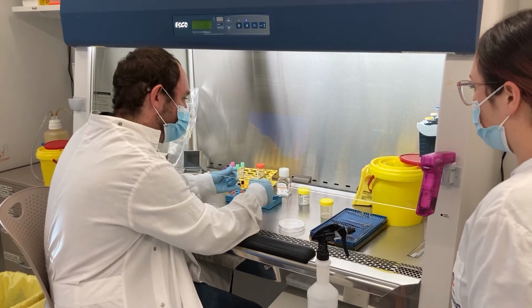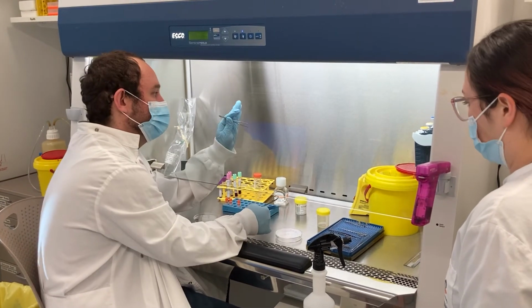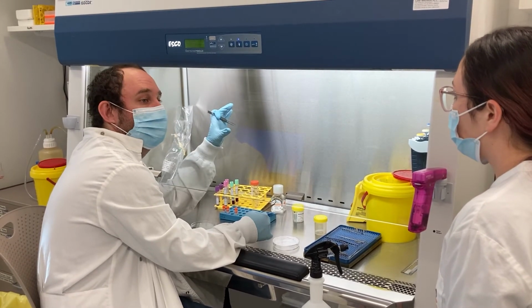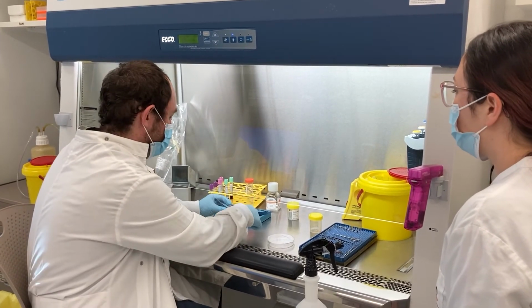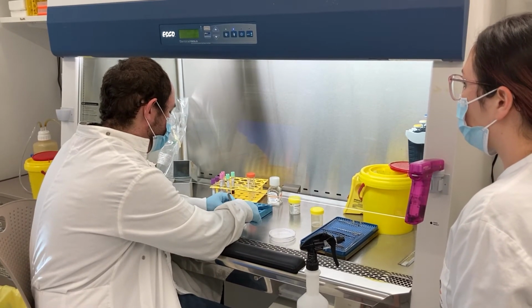So this indicates this tumour is loosely aggregated together. Yeah. It's coming off the polarized side of the urothelium, the lumen part of the urothelium, and it's popping out. And the clinicians cut through that to obtain the sample. So nothing too deep into the patient's tissue. And they'll get a pathologist to look at this and check it out.